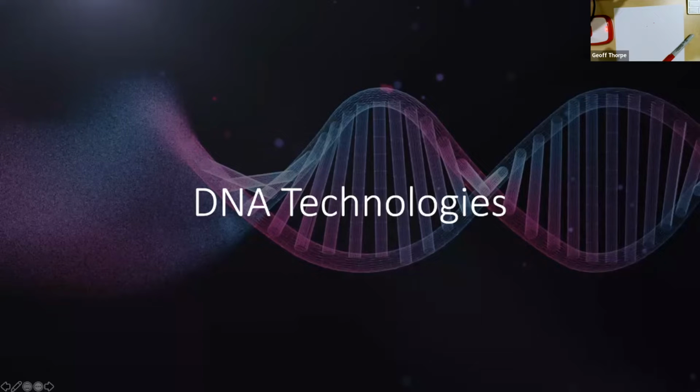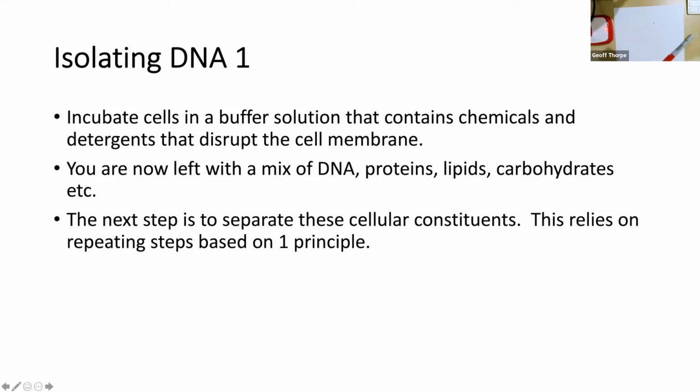In this video, we'll be looking at DNA technologies. And by DNA technologies, I mean techniques and methods that are used in a lab with molecular biology when working with DNA. So our first step is we need some DNA to start off with. We need some DNA to work with.